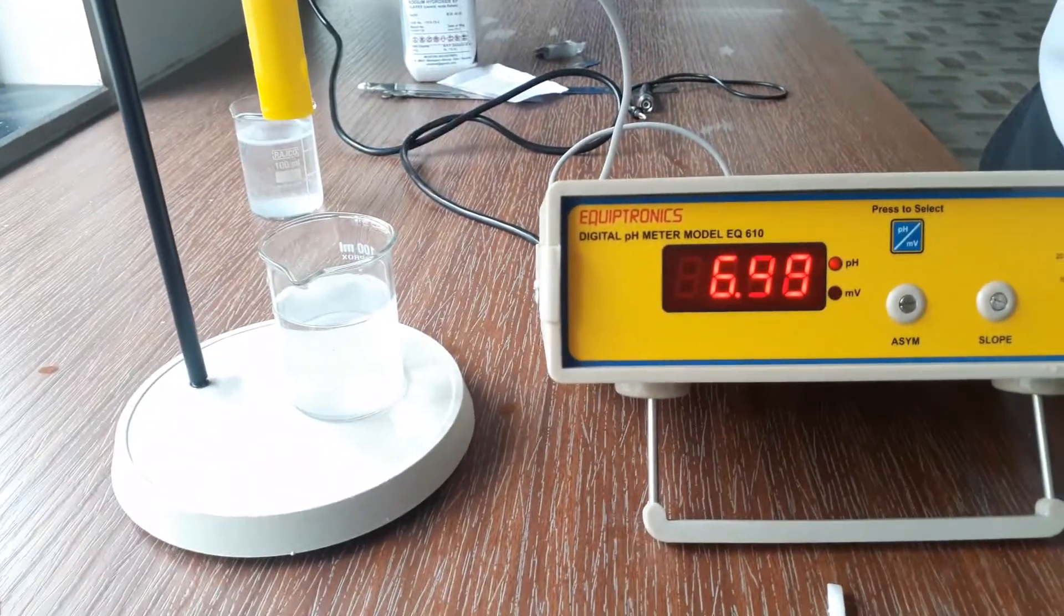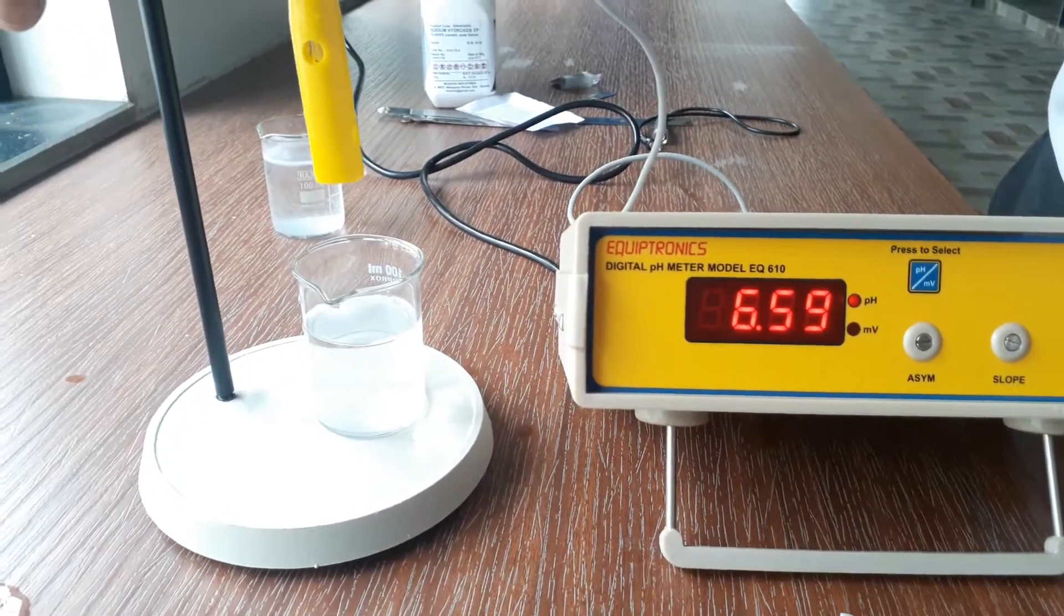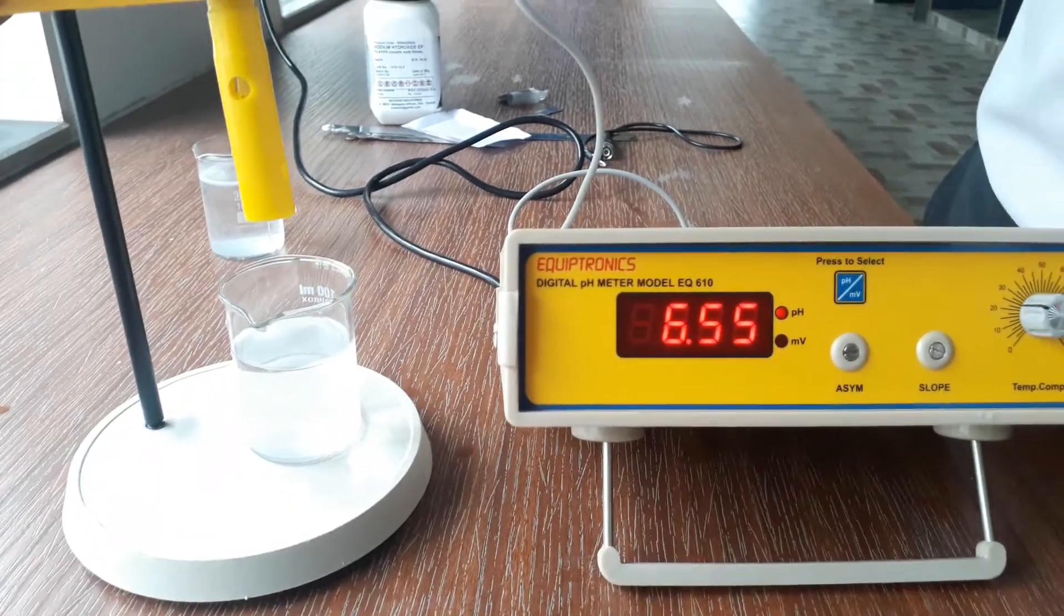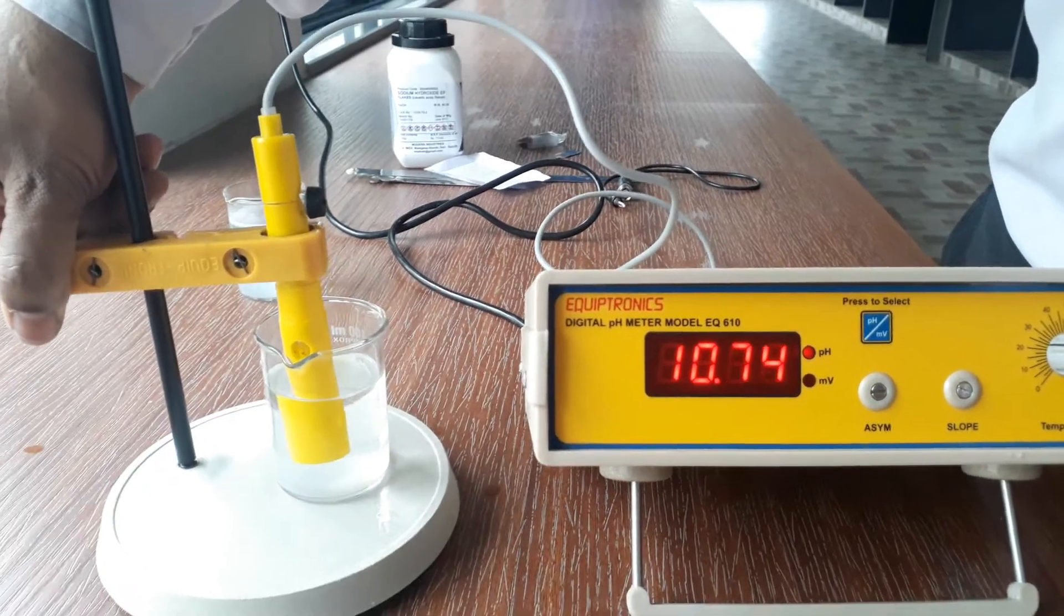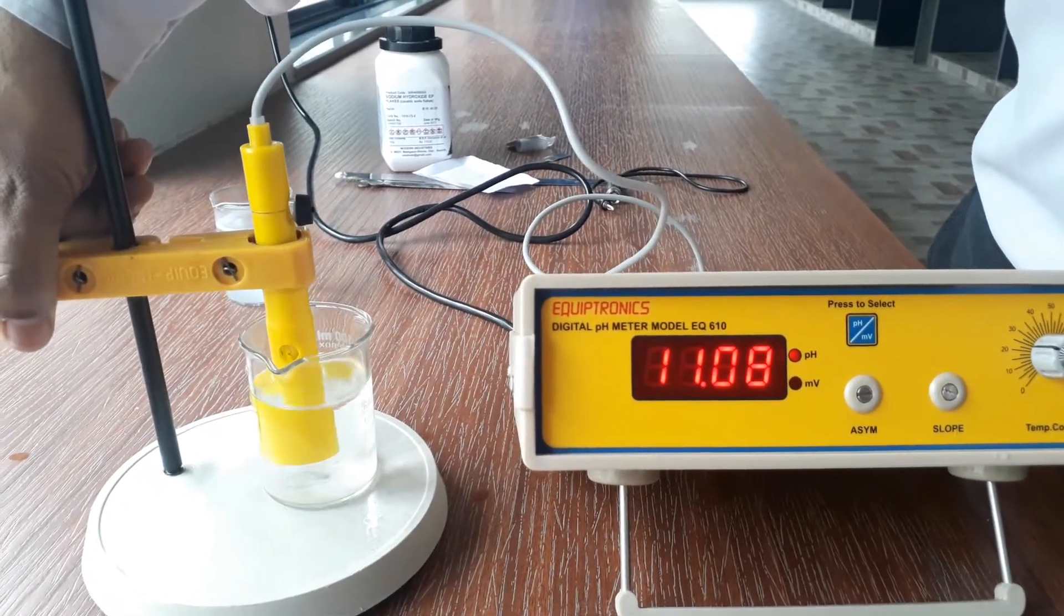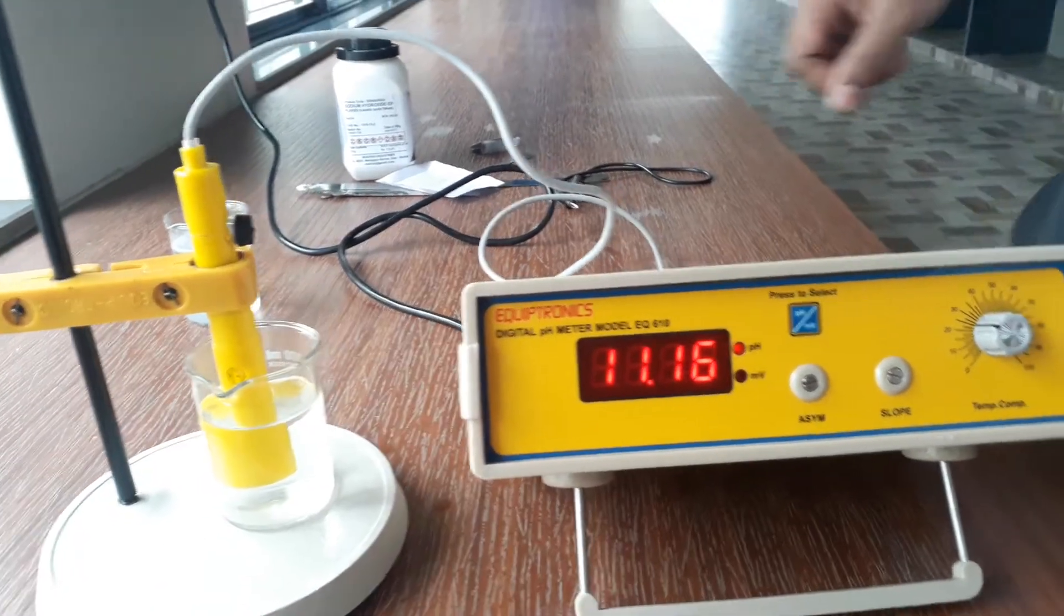If it was an unknown solution then we can determine the pH value or whether it is acidic or basic. But we know the solution already, that it is a base, so we can calculate its pH value. So see after dipping the electrode in the base, you can see immediately the value is changed.